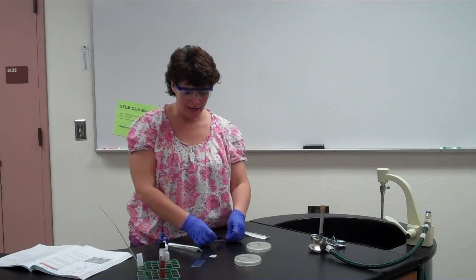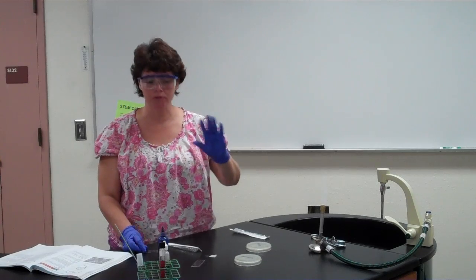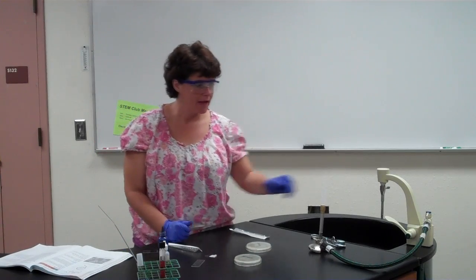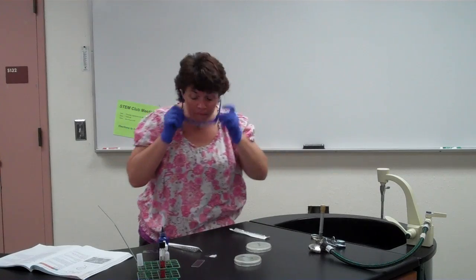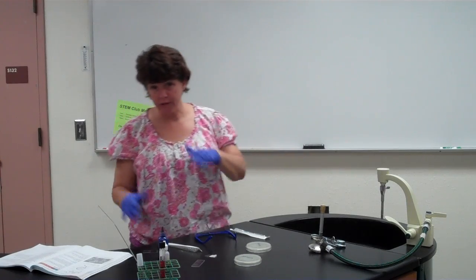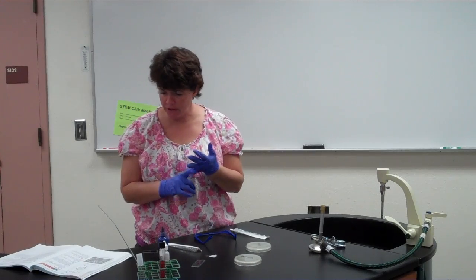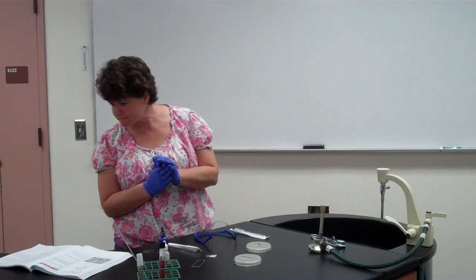So you're going to take that and you're going to observe all 5 of them. So you'd have a different slide for the 5 different species, and then you're going to look at the 5 different ones. Okay, so that's the first step. And then you're going to be looking for what do they look like, their size, their shape, do they appear to be budding or anything like that. The next thing you're going to do is the fermentation.